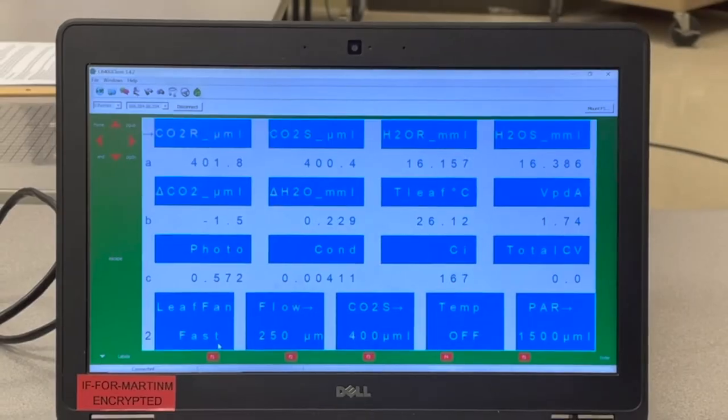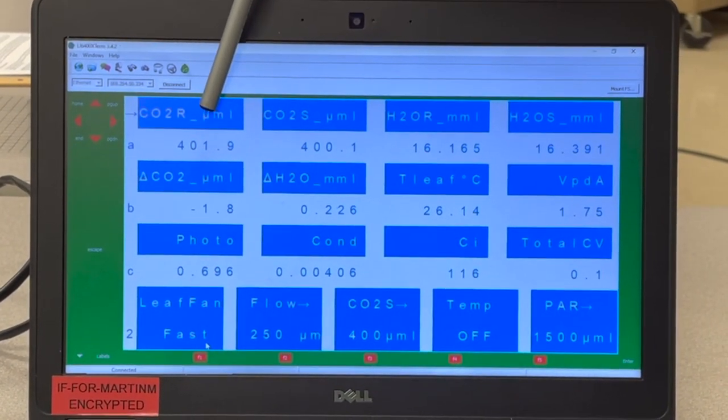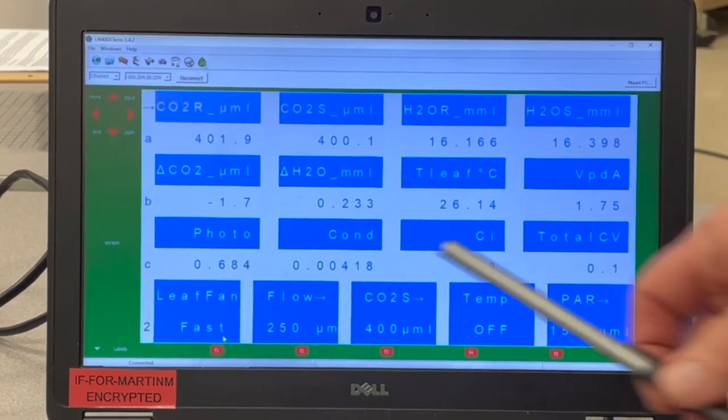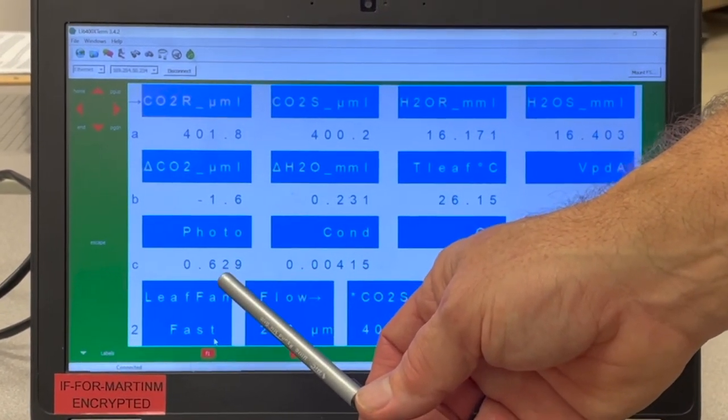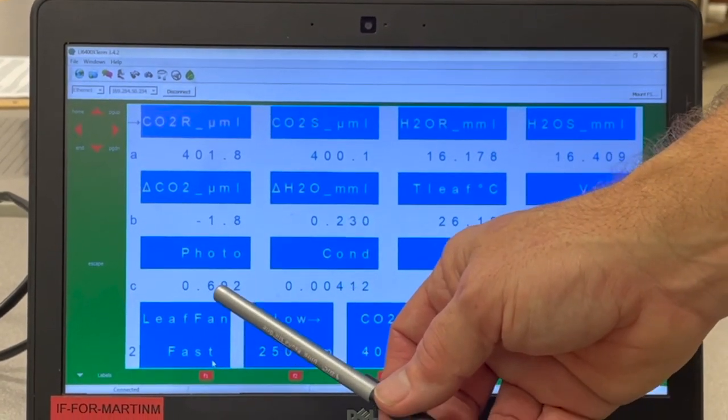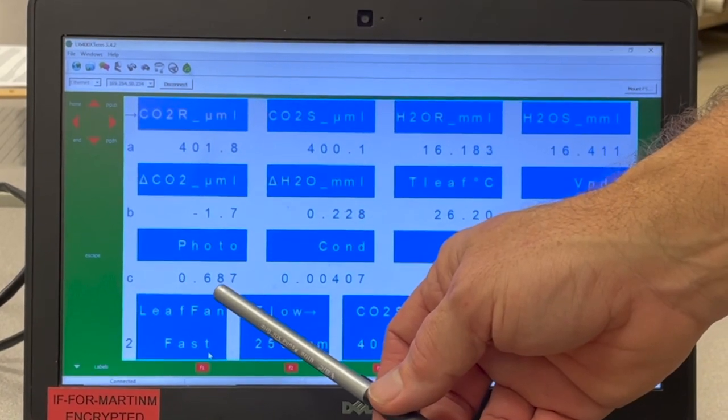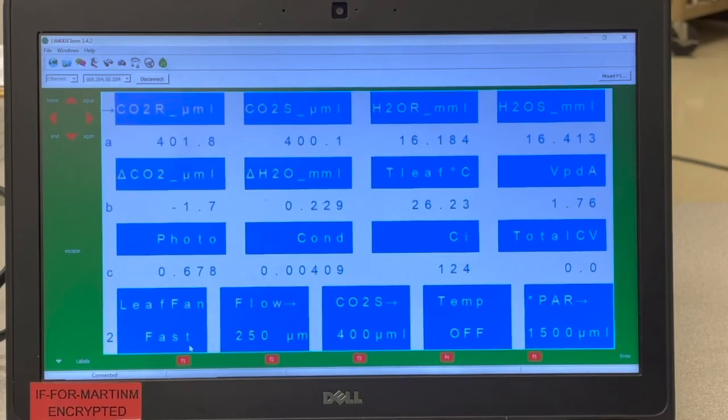What we see now is that CO2 sample is below CO2 reference, which means the leaf is photosynthesizing. This is the calculated net photosynthesis rate. It's a pretty low rate of net photosynthesis, but after equilibration it'll probably creep up a bit. This is the number that we would record for net photosynthesis rate of that leaf.